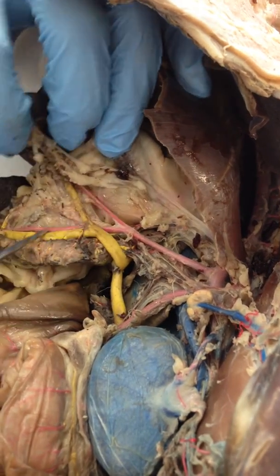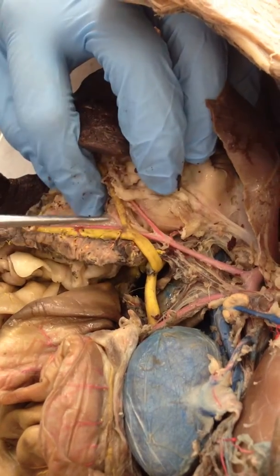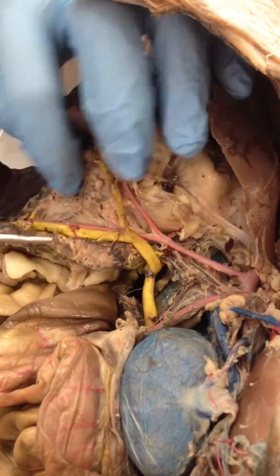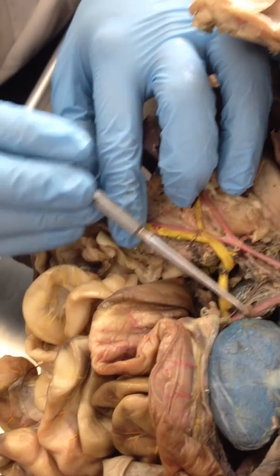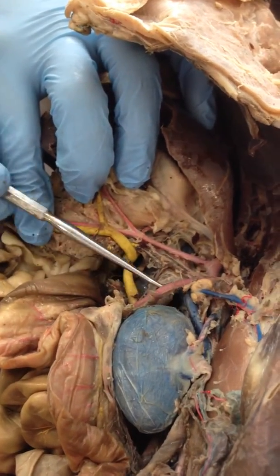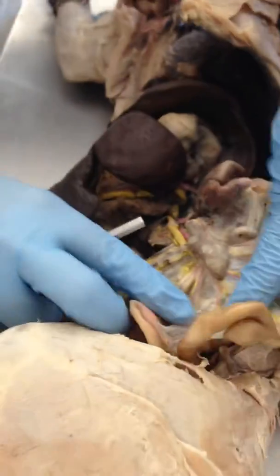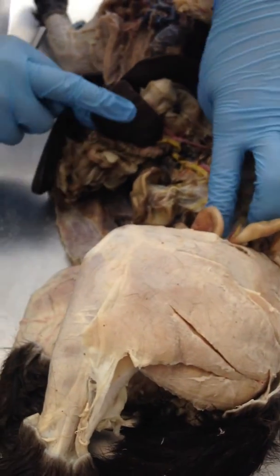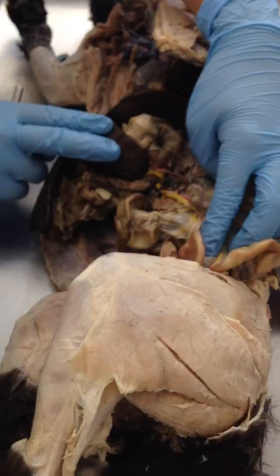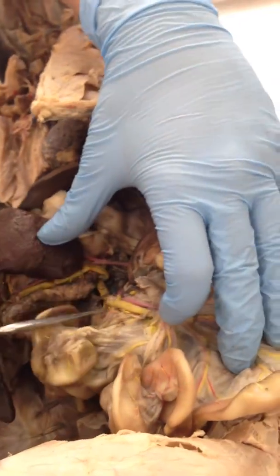And then this is the hepatic portal system, the yellow. It's part of the hepatic portal system. Do we need to know the specifics of each? Some of these are the splenic, and then they go into the superior mesenteric. That's all. I thought this one right here was the superior mesenteric. That's the superior mesenteric artery. Back here with the hepatic portal system, you've got all this. There's the superior mesenteric vein, this very large vessel. So this is the superior mesenteric vein, and they come in the same place, which makes sense.